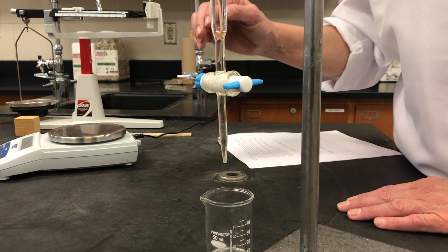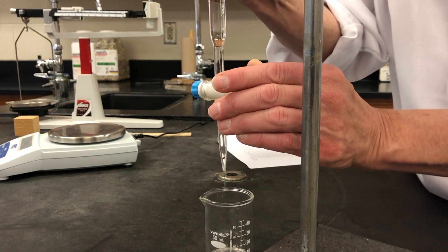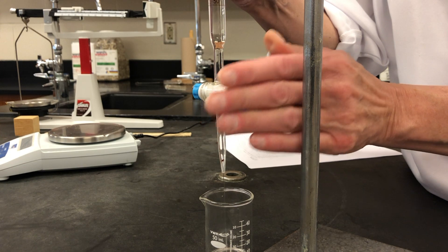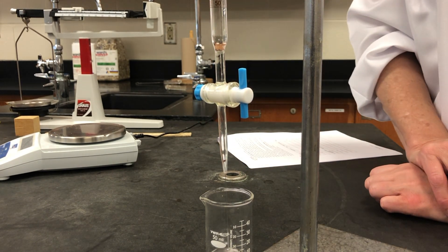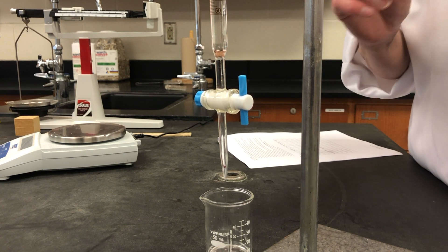We're going to be using a buret to dispense water into our beaker, so let's get our initial volume of water. Record the initial volume of the water in milliliters. Remember, the numbers are upside down and don't forget to estimate that extra digit.